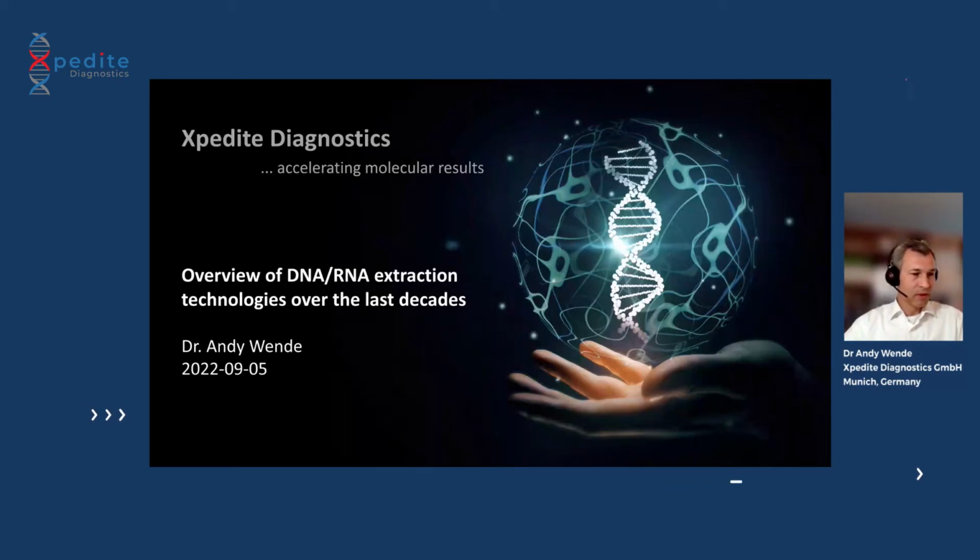Thanks again for the invitation. I can give you some insights on, or provide an overview of, DNA and RNA extraction technologies in general today. And in the second session, we will talk more about fast DNA extraction and its use in point-of-care diagnostics.